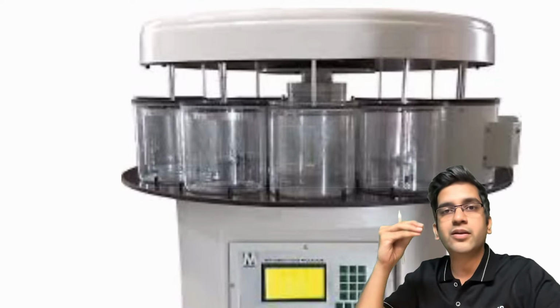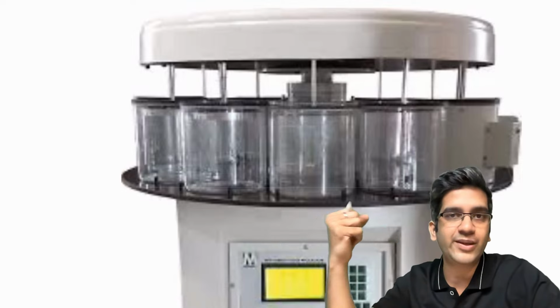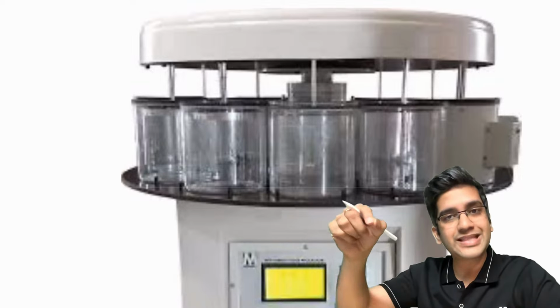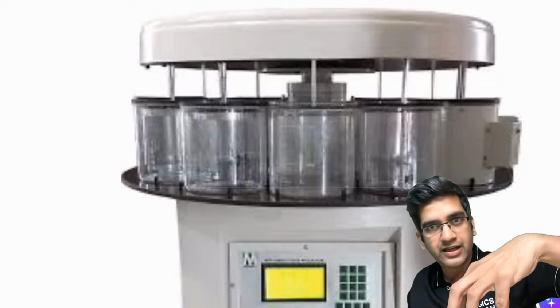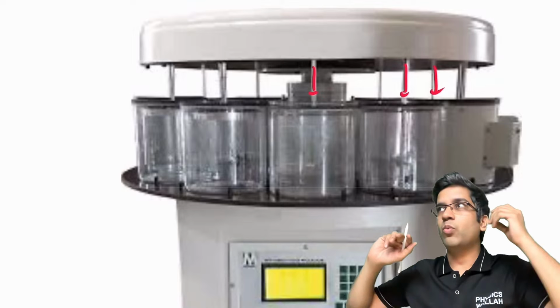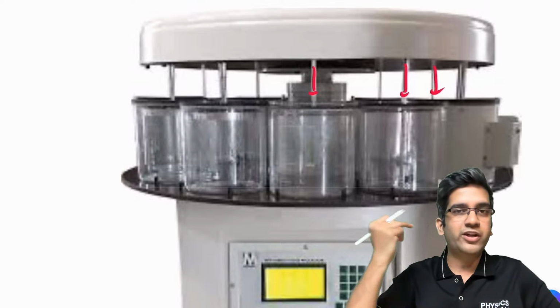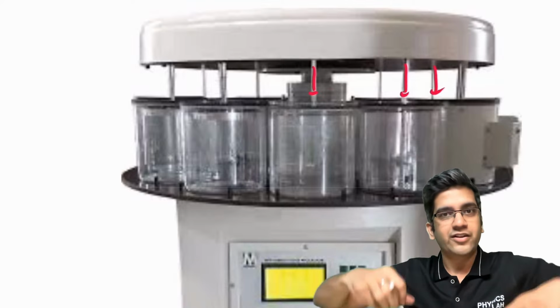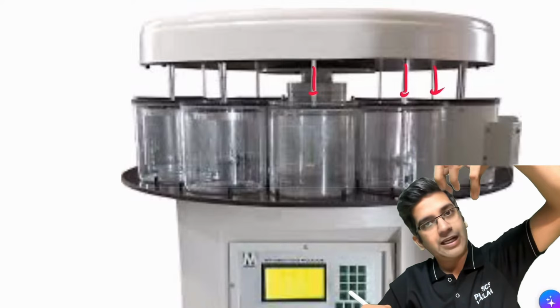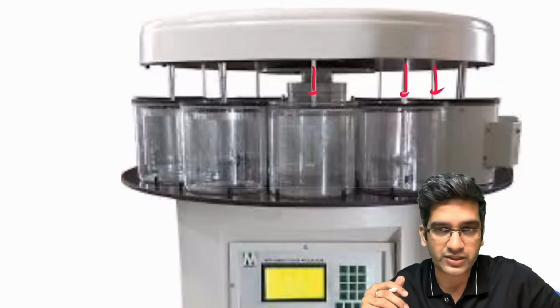Okay, Facti, what happens is, there are multiple containers here, right? So based on the time required, for example, I need the tissue to be stored in formalin for 40-50 minutes, or sometimes the last step might be like 10-15 minutes. We will set the alarm such that it stays in the same place. If you see, there's a hand, like the thing you must have seen rotating in your childhood days, where children play sitting on the horse. They move, they rotate, right? So once the time is over, it will be pulled up, allowed to drain, rotates, and goes to the next chamber, right? That's how it goes through the entire night. It keeps on processing, right?